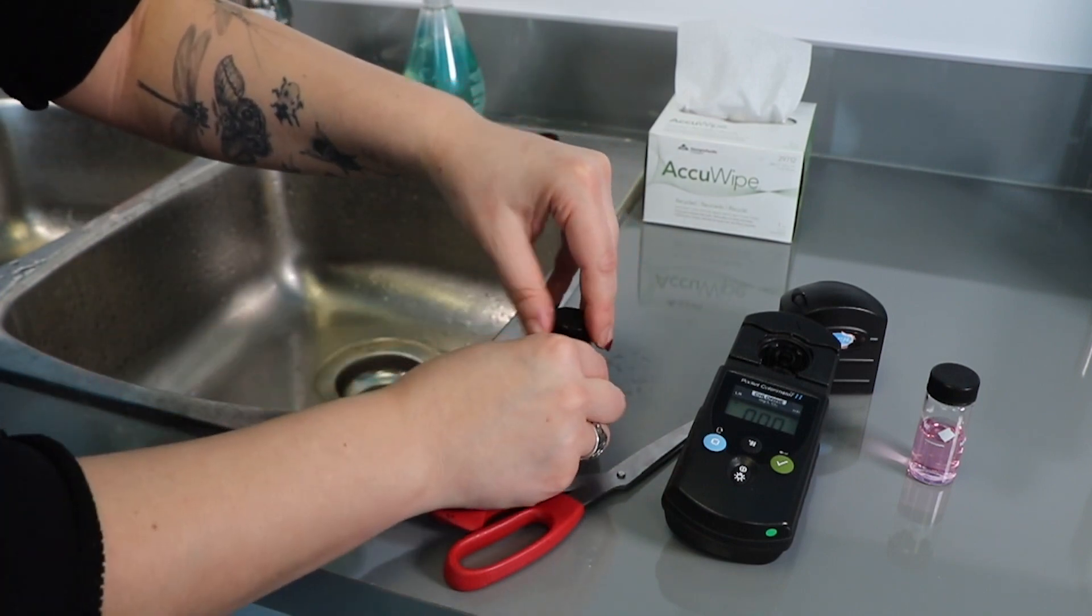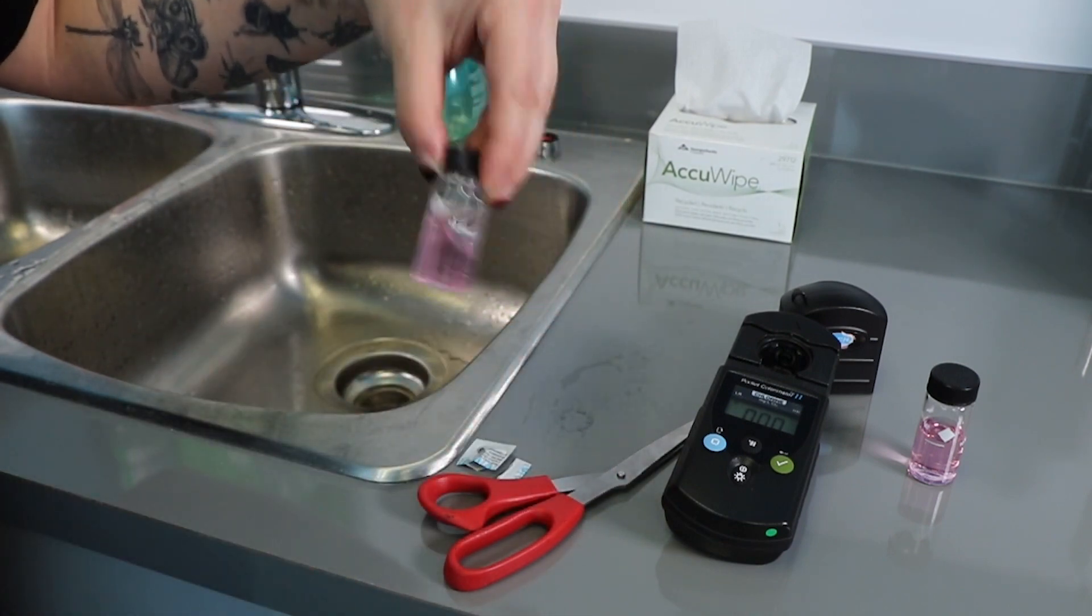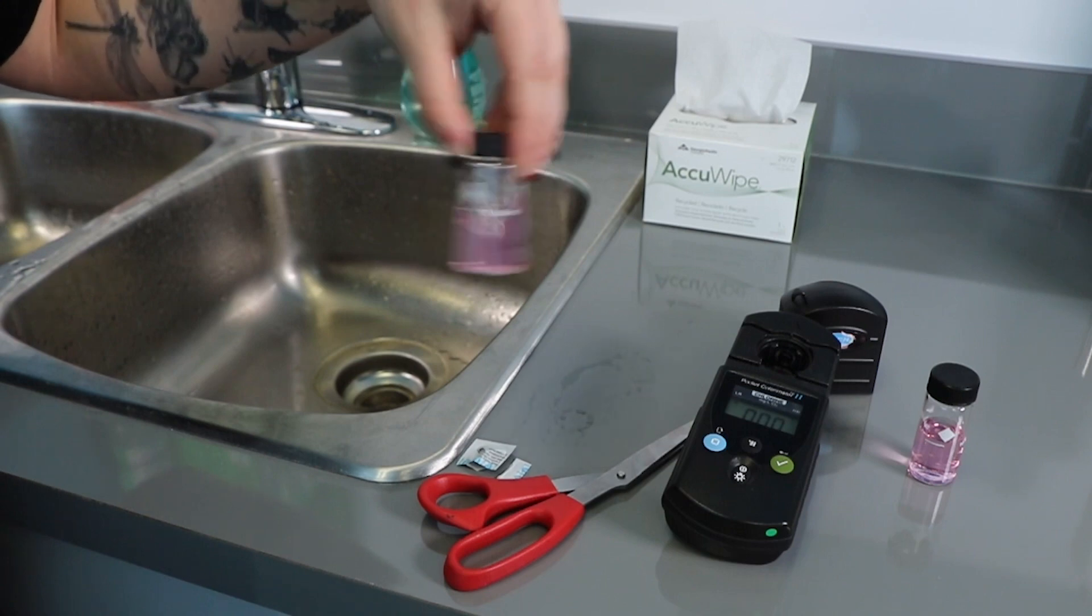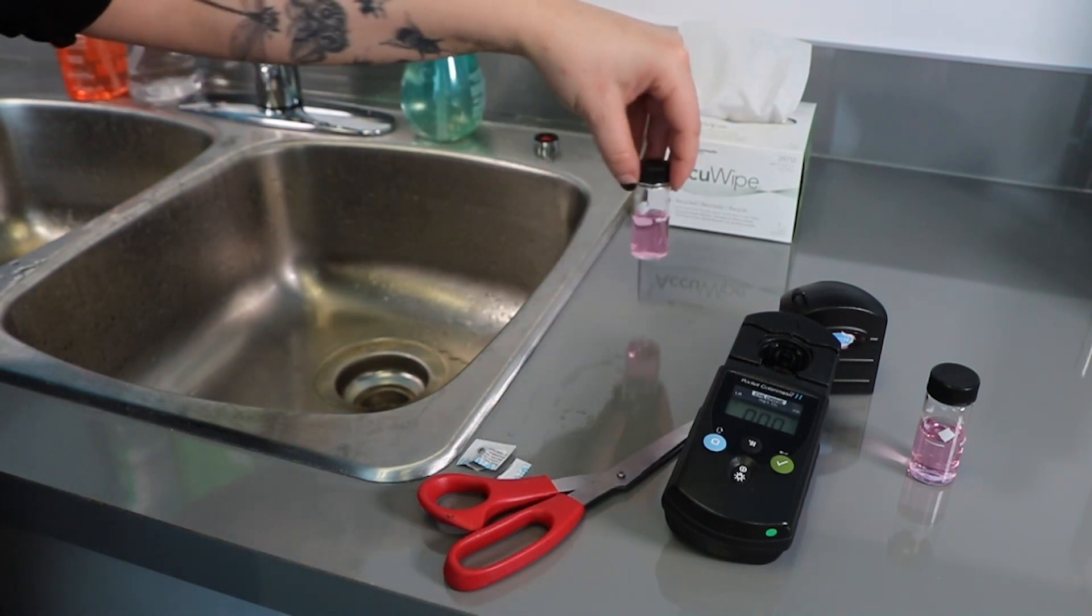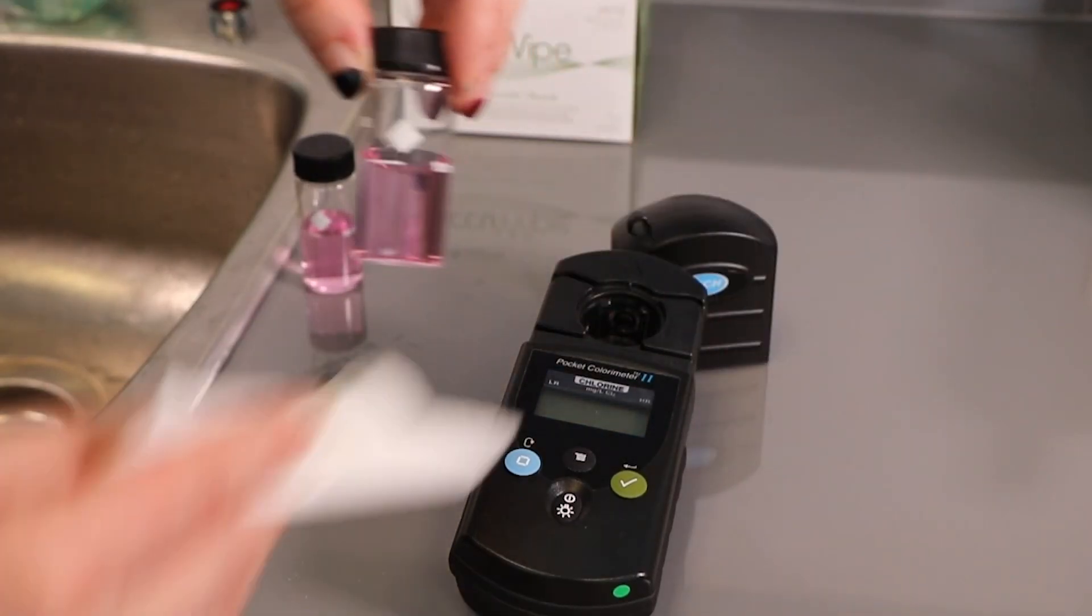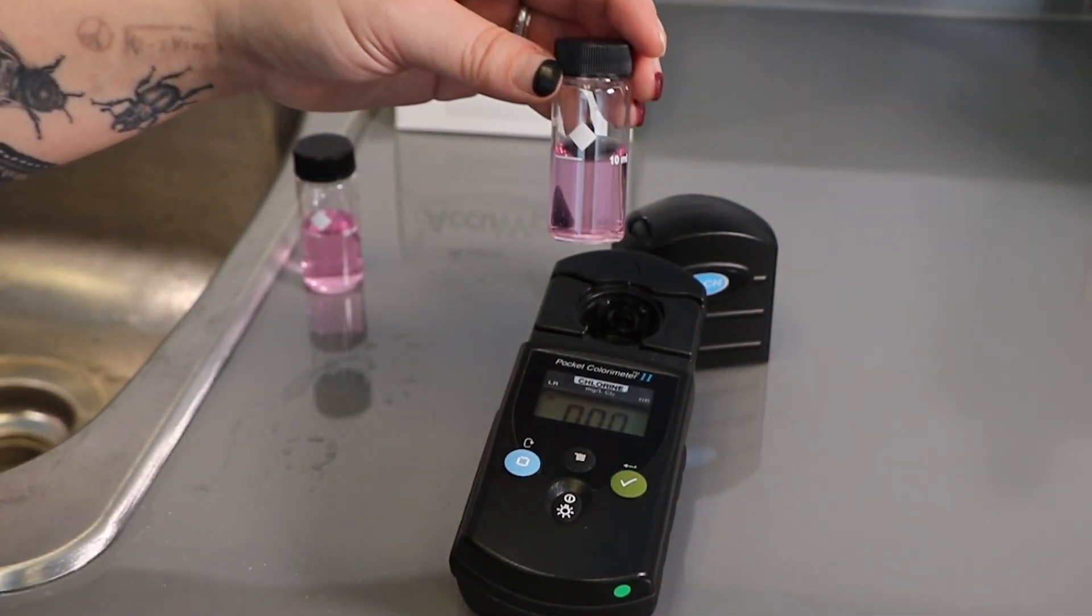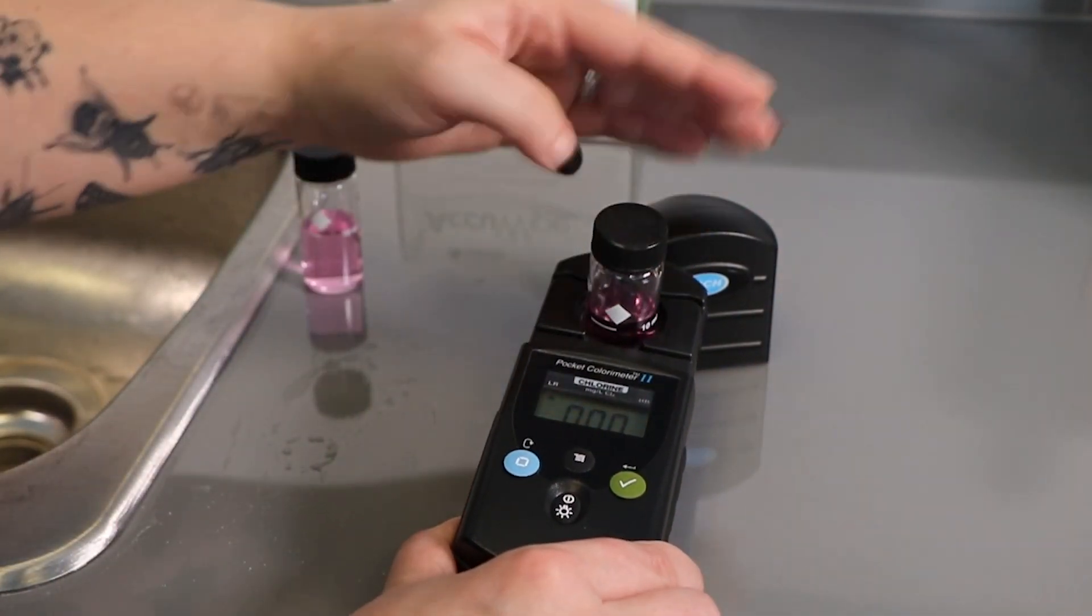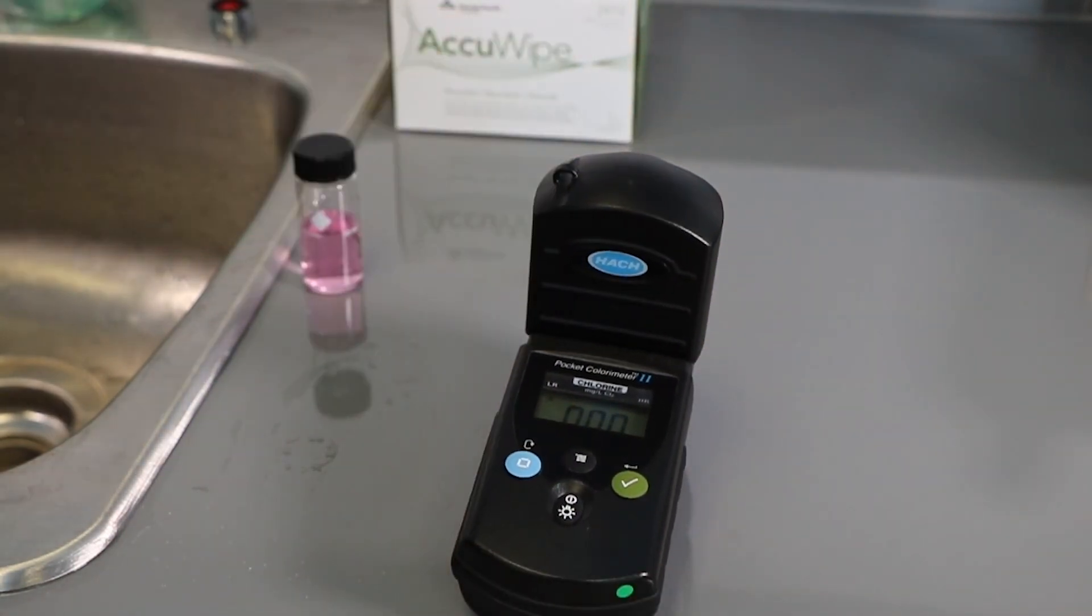Replace the cap and shake gently to dissolve the DPD reagent. Carefully dry the outside of the sample vial with a lint-free cloth, like an acuwipe, to remove any fingerprints and any traces of liquid. Place the prepared sample vial in the measuring chamber. Make sure the diamond-shaped marker is facing the screen and replace the instrument cover.